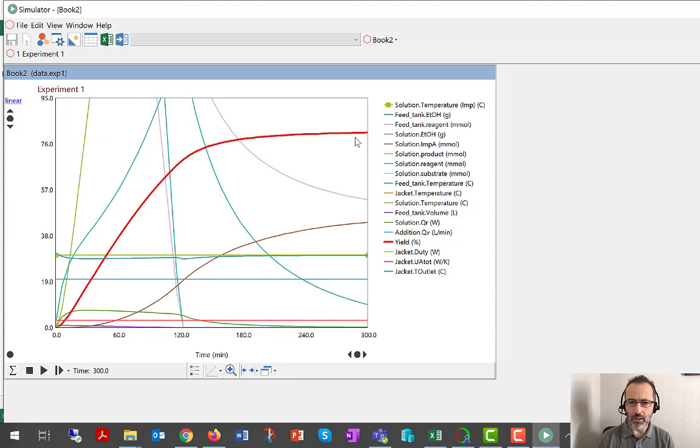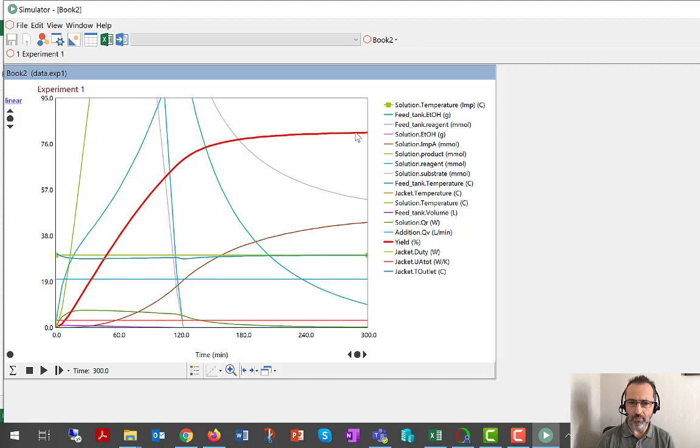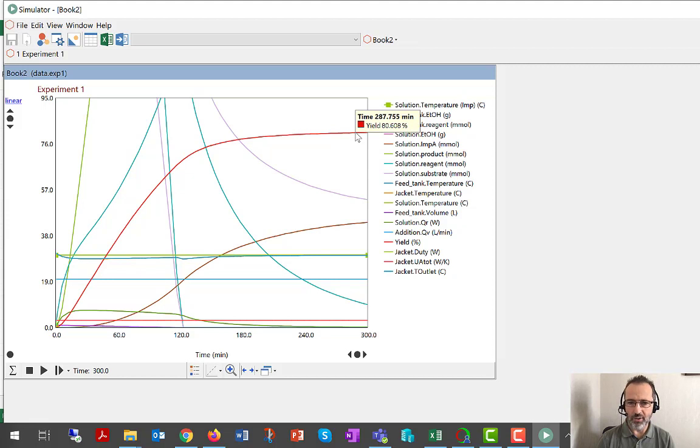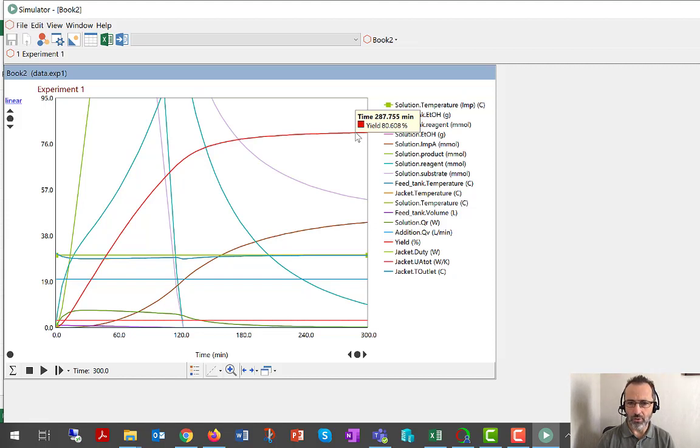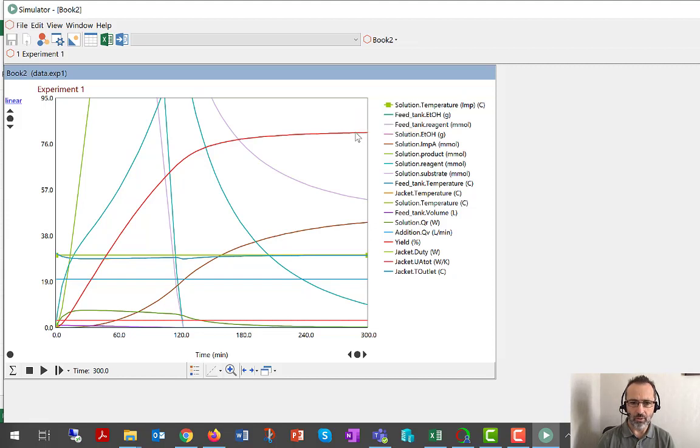I'm also going to click on yield. This isn't reaction optimization training, but the yield is higher when we run at 30 degrees C. So that does show a good use of a model like this to find conditions that operate with acceptable yield.